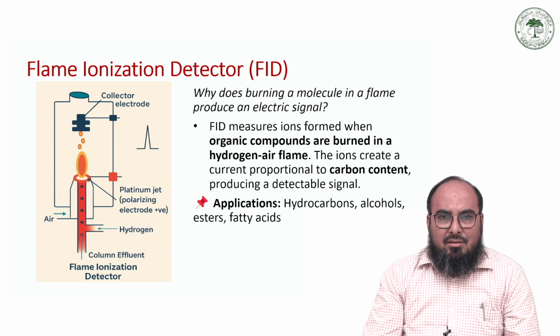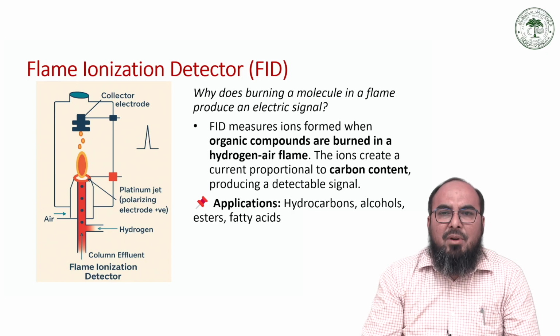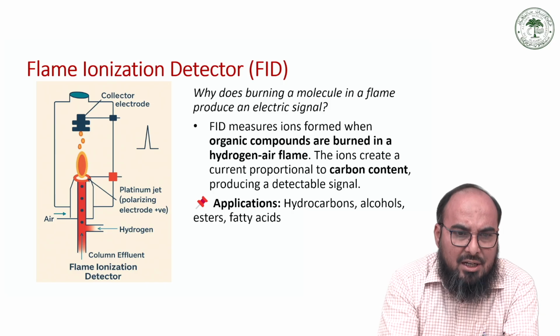So let us start with the one that is called the universal detector, the flame ionization detector, or simply FID. Now you can see the pictorial representation of FID.